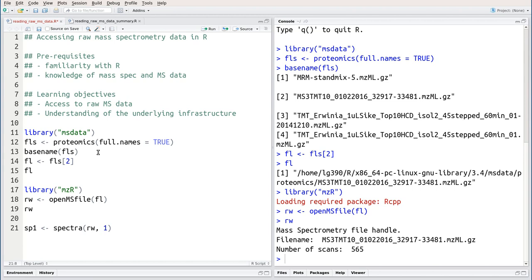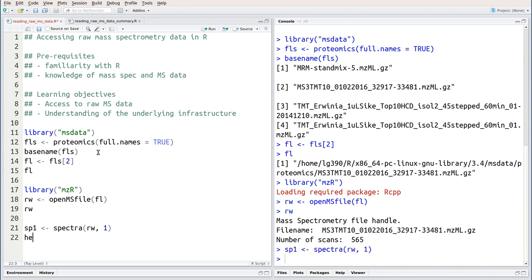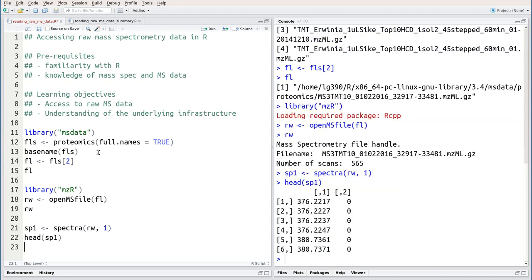This creates a matrix that contains two columns. The first column represents the m over z values and the second column the intensities for these respective m over z values.